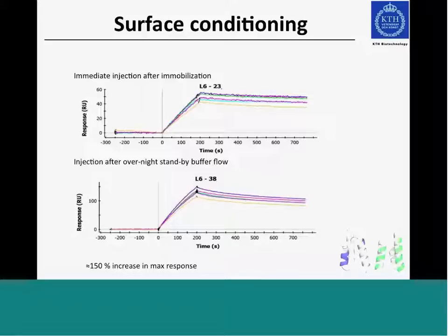In this case, the protein that we are immobilizing is very small, about 7 kilodaltons, and we don't really know much information about the fold, so that could be something to take into account. But this works very well to do all analysis, and then also at the end we do another reference injection just to see that they don't have any bias.